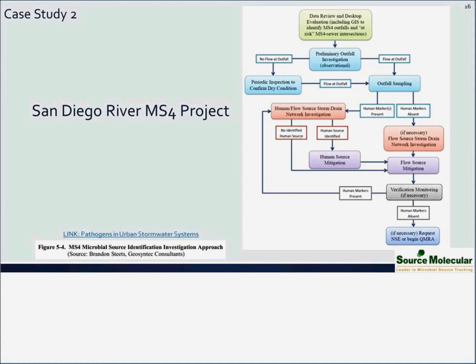Okay. Another comment was sent in. If you can check the chat that I sent you, Mauricio, it's a paper. Yes. Do you have any comments on that? For those of you on the line, it was Enterococcus and E. coli fecal source apportionment with the microbial source tracking genetic markers. Is it feasible? And Mauricio's answer is yes. I mean, I don't know the study offhand. I'm actually just pulling it up now.